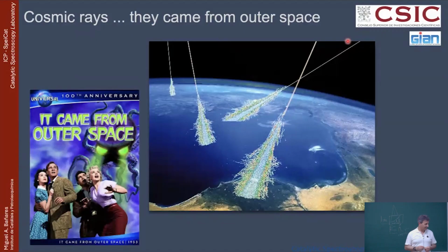That means if I have a complete monolayer coverage, the chances of fluorescence are going to go down. It should go down, because I don't really know the nature of it, because something that I found somewhere is not that much studied, but that's actually quite an issue. Because usually you wouldn't expect that. You get a nice ambient thing, and ambient things means hydrated, and then you heat and you get that. Yeah, because that's my experience with some moly on alumina. Mm-hmm.